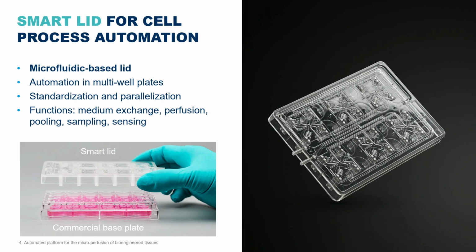We can also bring other functions to this smart lid, such as perfusion, pooling, or sampling and sensing, as mentioned by Sandro before. And today, I would like to present the perfusion function that we can address by using this smart lid technology.